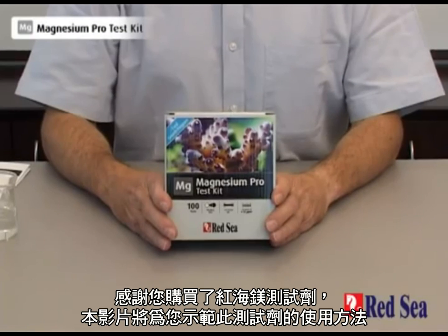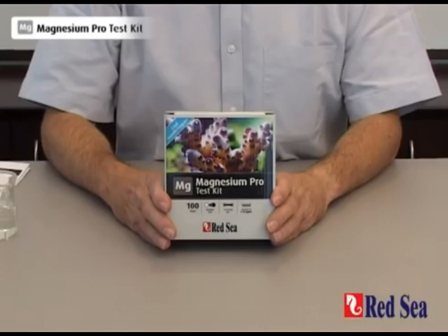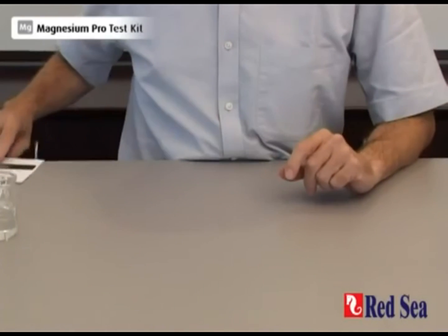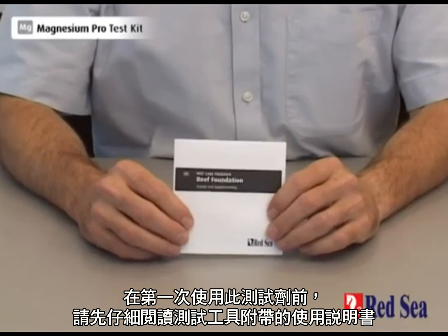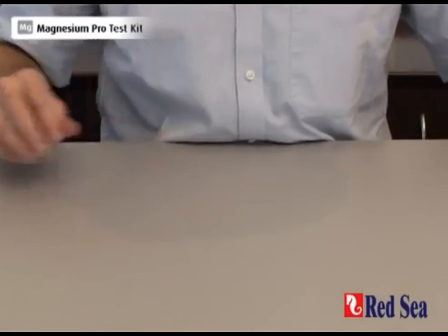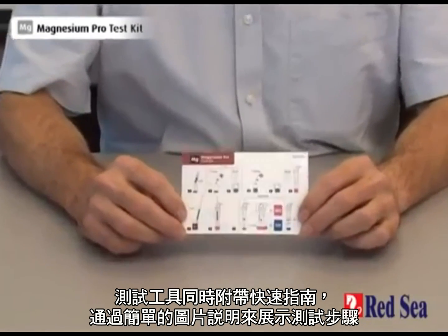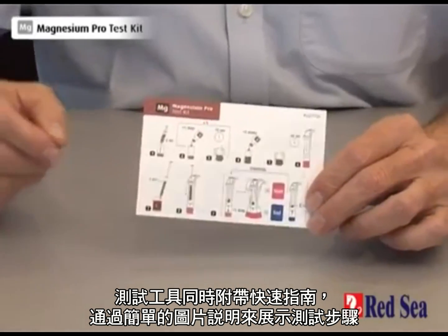Thank you for buying Red Sea's Magnesium Pro test kit. The purpose of this video is to demonstrate how the test is performed. Before using the test for the first time, make sure you carefully read the instructions in the manual provided with the kit. The kit also comes with a complete quick guide showing the stages of the test in simple graphic instructions.